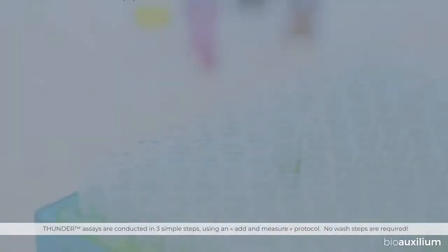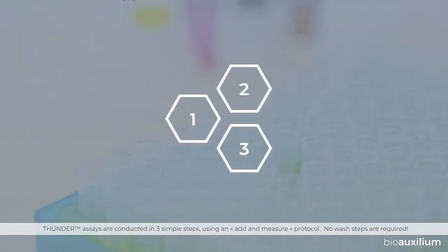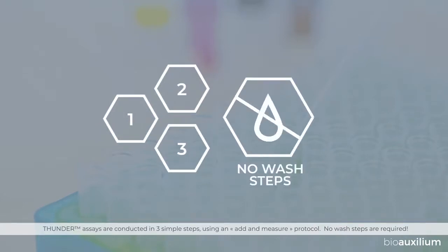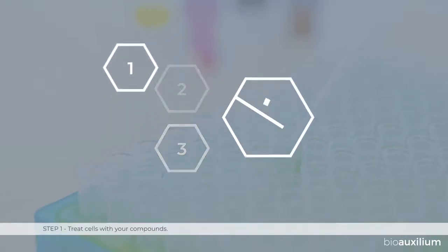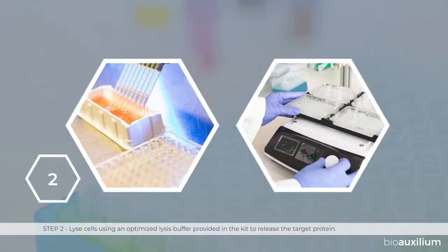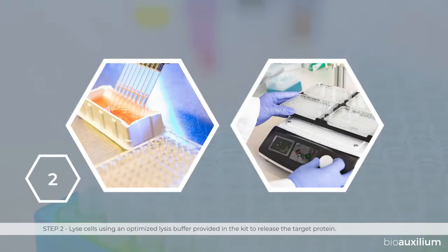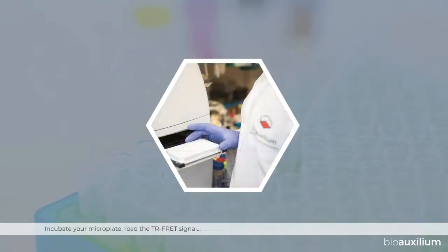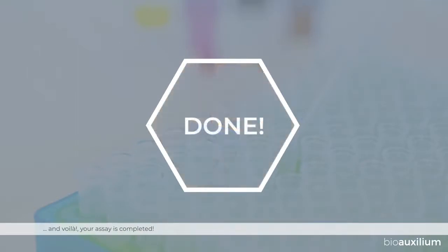Thunder assays are conducted in three simple steps using an add-and-measure protocol. No wash steps are required. Step one: treat cells with your compounds. Step two: lyse cells using an optimized lysis buffer provided in the kit to release the target protein. Step three: add the antibody detection mix made of two target-specific antibodies. Incubate your microplate, read the TR-FRET signal, and voilà — your assay is completed.